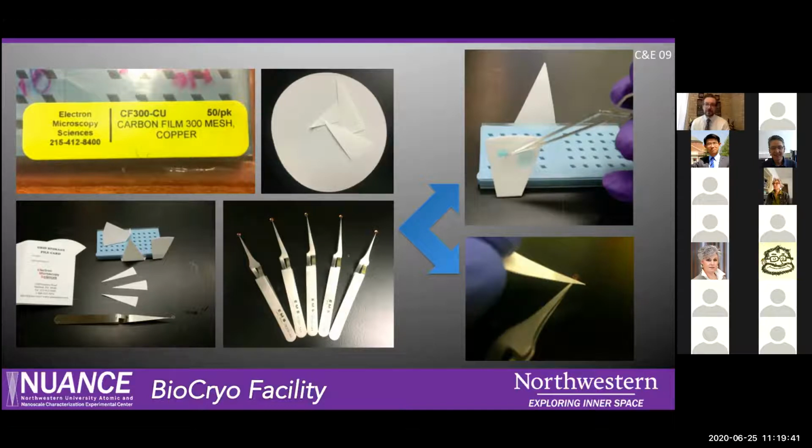The more anchor points you have, the less steady things are going to be. In my technique at the bottom there, I'm only using these negative action tweezers. I just set them down on the bench, and then I draw my filter paper up the edge of the tweezers, and I try not even to touch the grid, just very much on the little tip there.